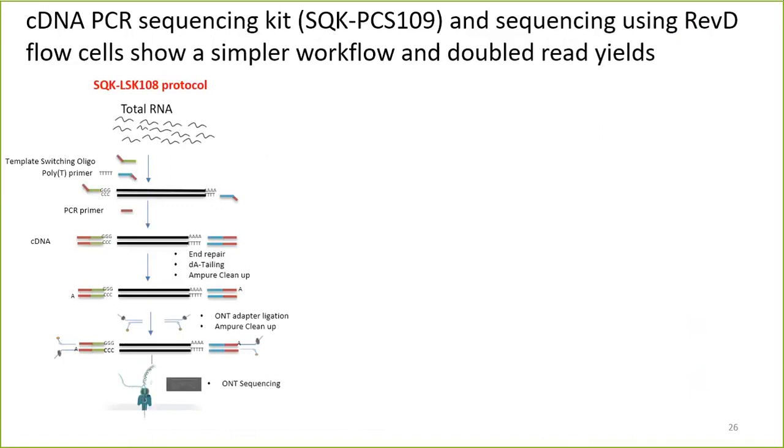So in this last slide, the presentation is sort of finished, but I just want to share some experience that we've had using nanopore kits. The work that we did used the LSK108 protocol. In this protocol, you get your total RNA, and then in our hands, we designed our own primers and performed our own cDNA, and it is after the cDNA that we use nanopore adapters to perform the sequencing.